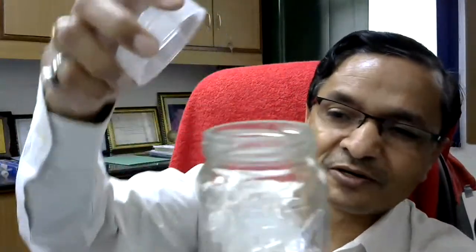So I was telling about another Eppendorf tube. You can see this is 0.5 ml or 500 microliter Eppendorf tubes. Generally what we used to do is put them in a bottle, close it, and autoclave it so that the tubes will be sterilized.